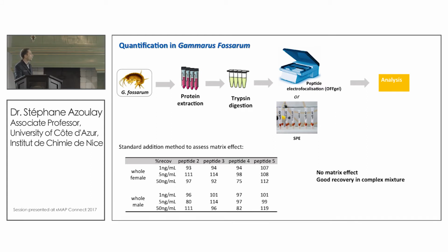We first did a standard addition method to see if there was any matrix effect. Everything was okay. There was no matrix effect and a good recovery for all the peptides, so it was nice for the assay. That means that we can use the assay in a complex mixture of many peptides and non-digested proteins.